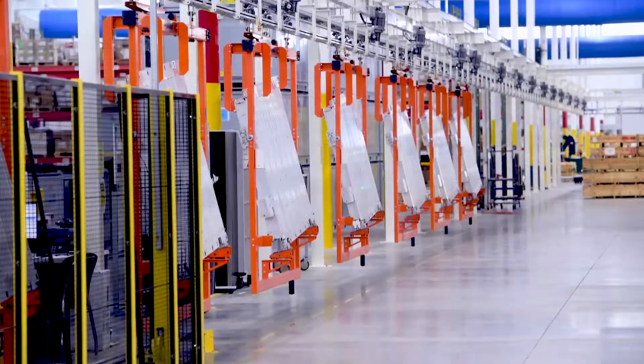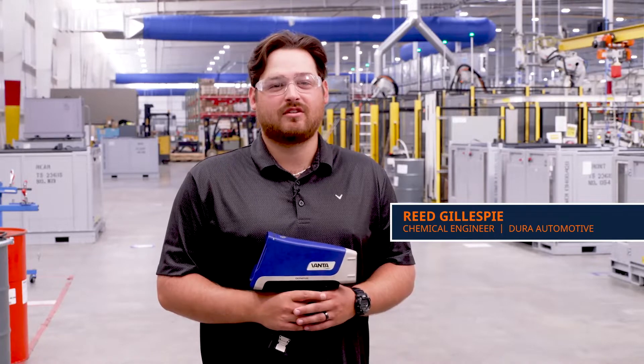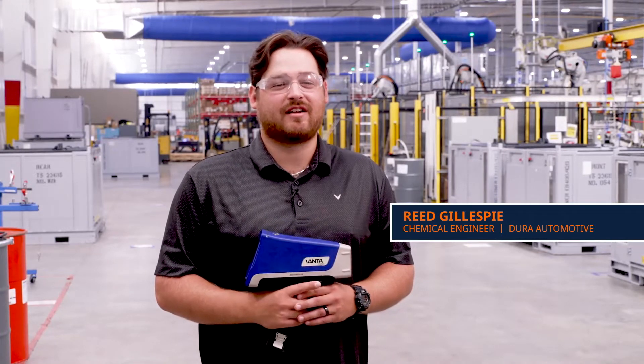Here at Dura we make battery trays for Mercedes. I'm Rick Gillespie, a chemical engineer here at Dura Automotive in Muscle Shoals, Alabama, and this is the Vanta XRF analyzer.